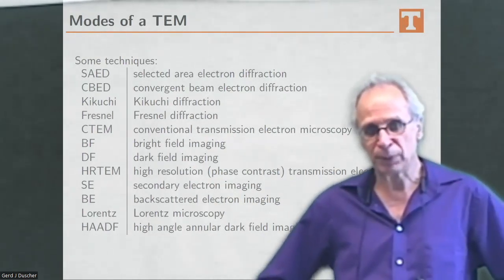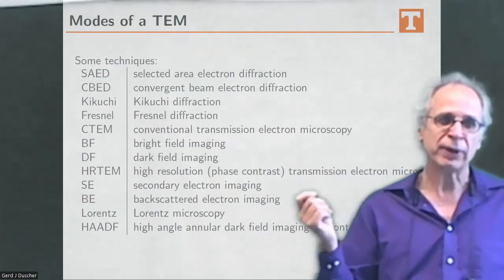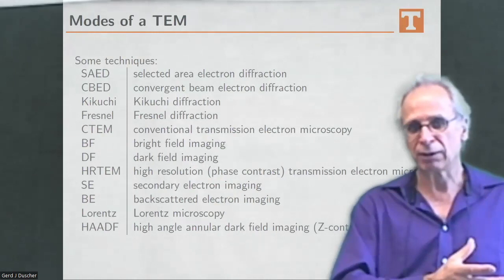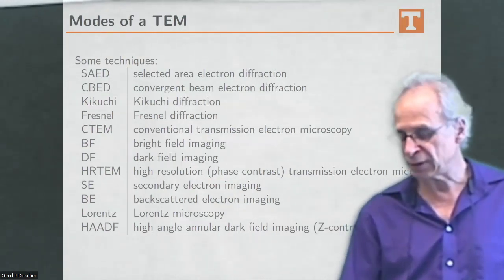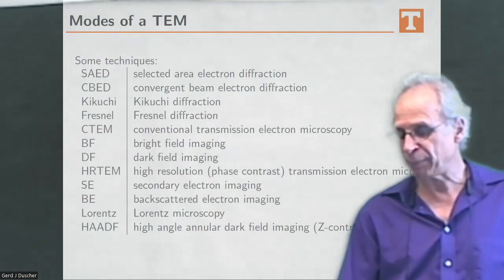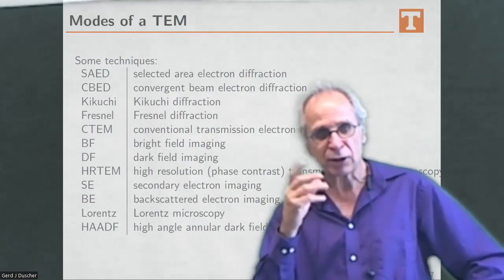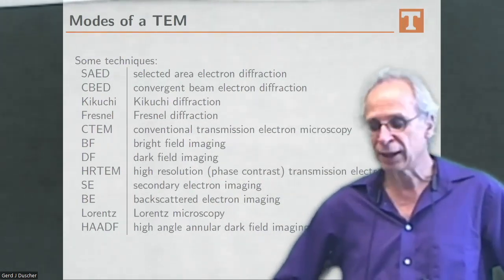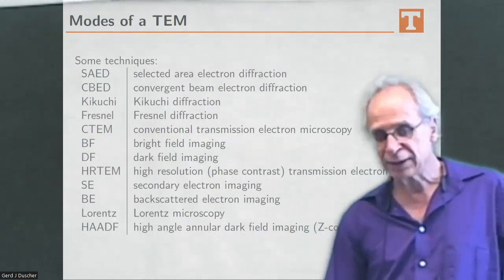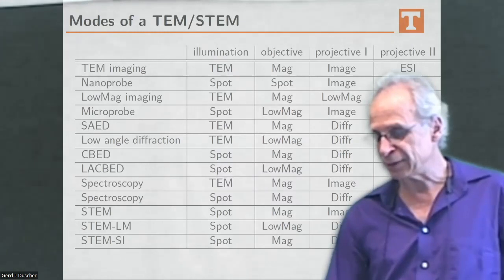So don't be surprised if I go over many of the ones with parallel illumination, because we will see how these two things are really always happening. If you think you only have to know about the scanning transmission electron microscope, I have to disappoint you. So we actually learn from both sides here.